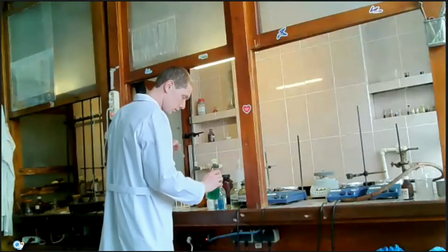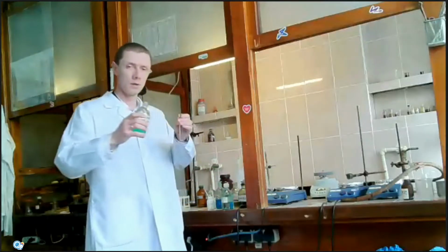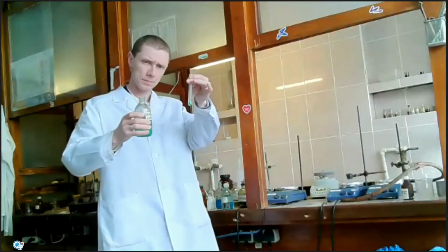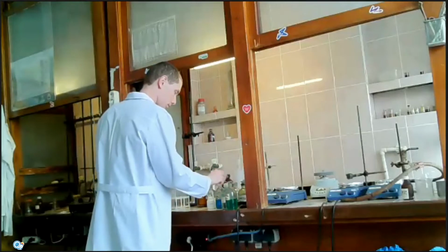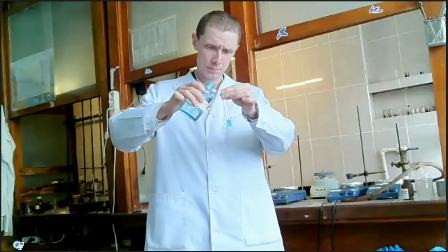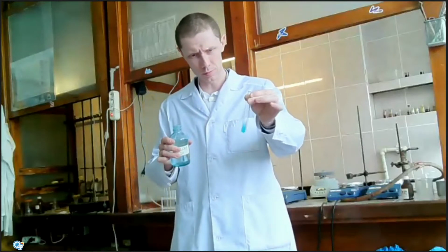The same reaction with nickel salt, nickel sulfate. If I add a small amount of ammonia, a small amount of green precipitate was formed.